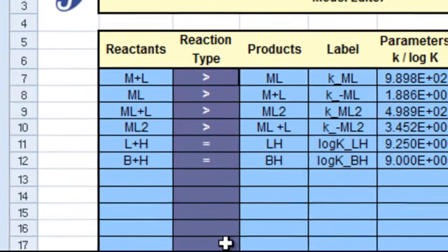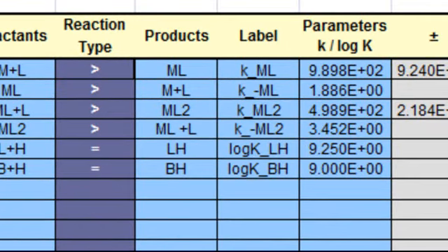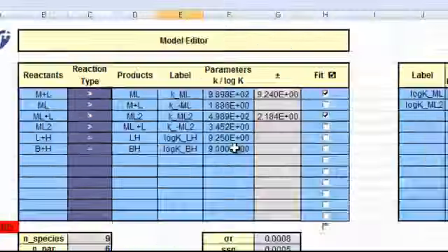The protonation equilibrium of the ligand is effectively instantaneous and represented by the equal sign. The buffer equilibrium is represented in the same way. The parameter provided is the log of the actual equilibrium or formation constant, as this is computationally more robust than using the absolute value. I have also added some helpful text labels to the individual reaction steps for reference. It should be noted that the log of the buffer association constant is numerically equal to the buffer pK, since this is derived from the acid dissociation constant, whereas ReactLab requires all equilibrium constants to be presented as association constants.